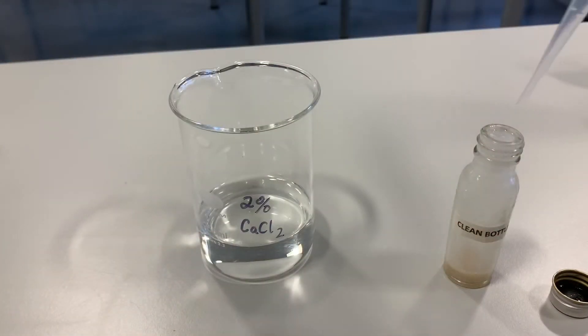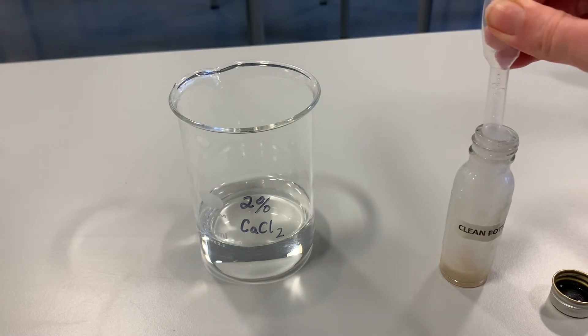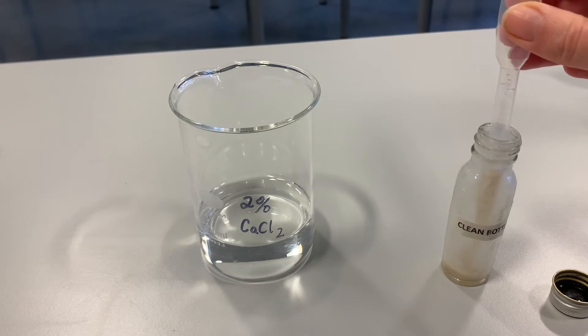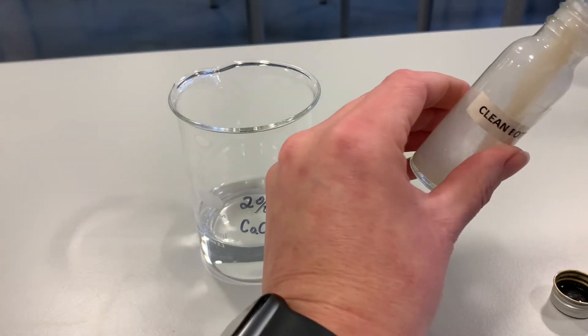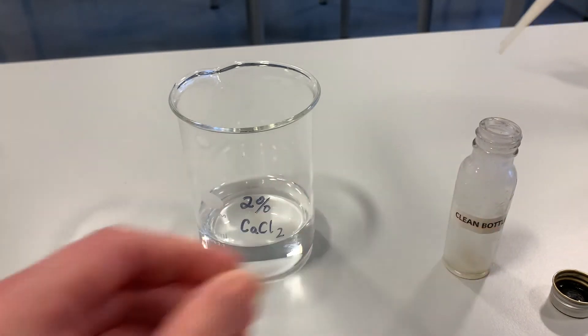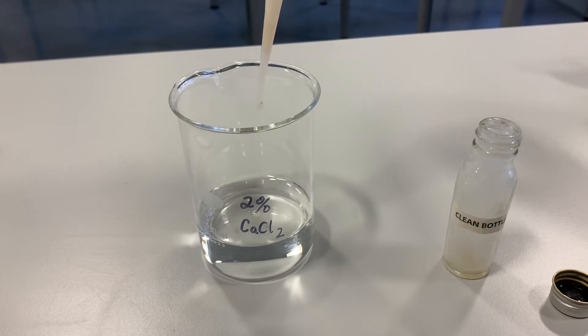Now we are going to draw up our mixture of yeast and sodium alginate into a dropper, and what we're going to do is drop that into our calcium chloride solution. Upon hitting the calcium chloride solution we should start to see little beads forming, and inside those little beads is our yeast — and that's what we mean by immobilised yeast.